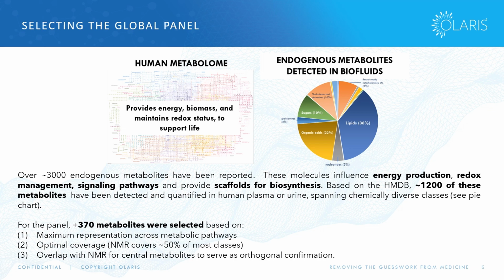So then, based on a subset of those metabolites that we selected, the first step really was to identify the best LC column and also the best separation conditions. And so we wanted to focus more on the polar metabolites first, and that's why we decided to go with HILIC LCMS. And so there's various columns that we tested that are shown here, and they were tested with mobile phases, with pHs, with low, neutral, and high pH.